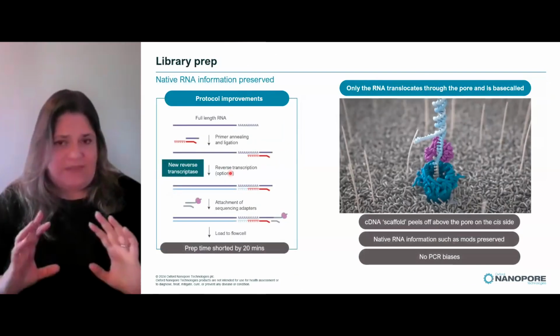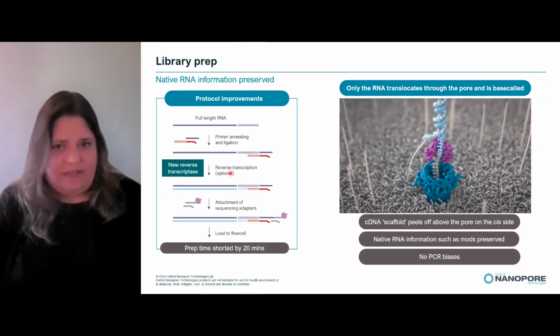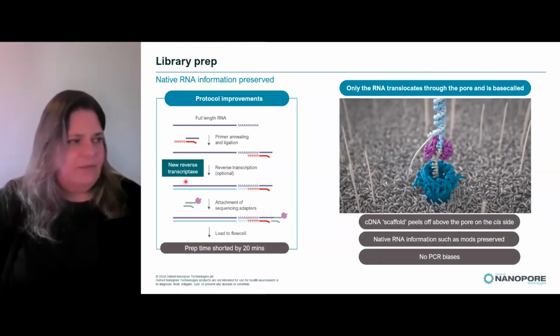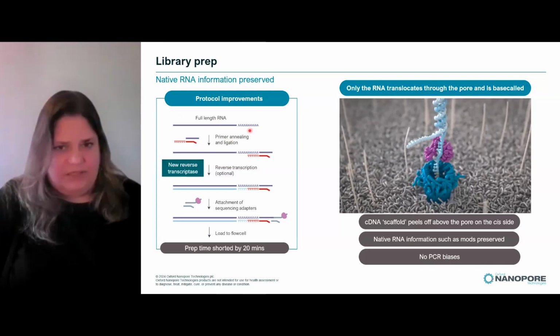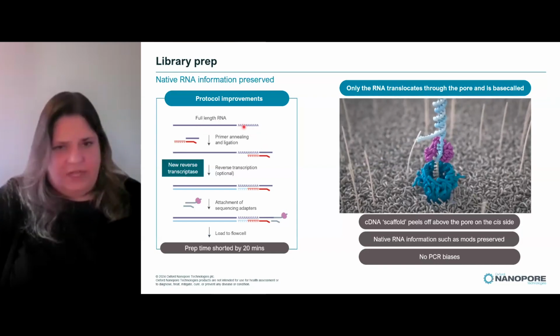So now that you've approached this with the ability of having the best quality RNA, how does the kit actually work? What we've got here in this panel is the methodology. Again, I mentioned that it works on things that are polyadenylated at the 3' end. So this would be your mRNA.